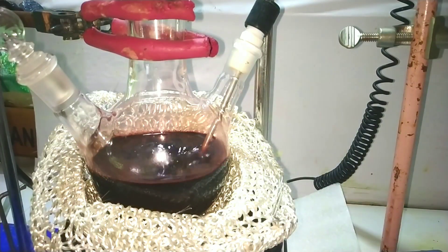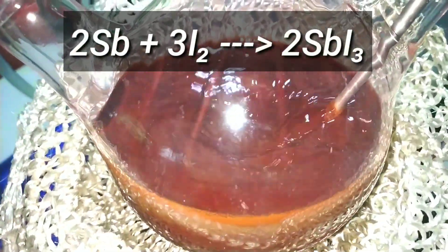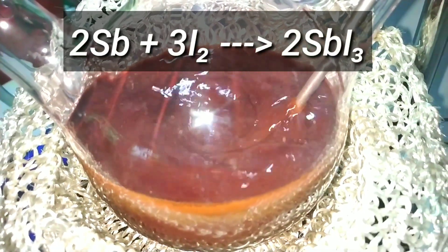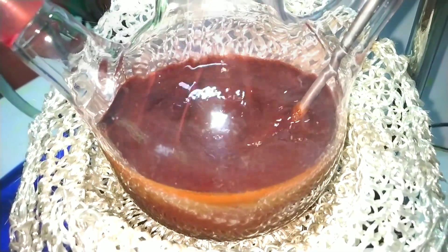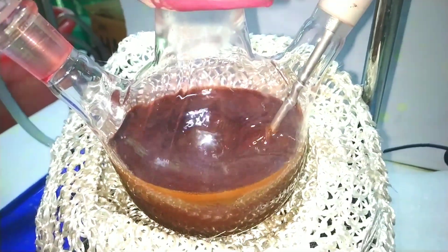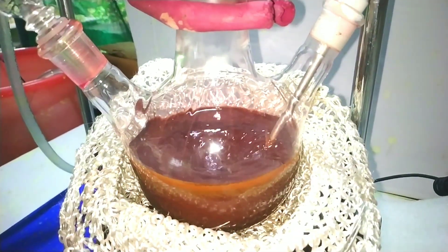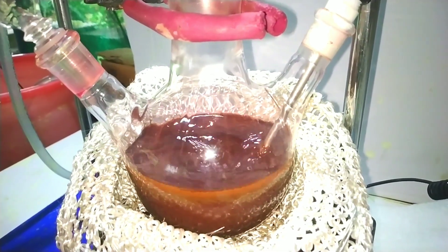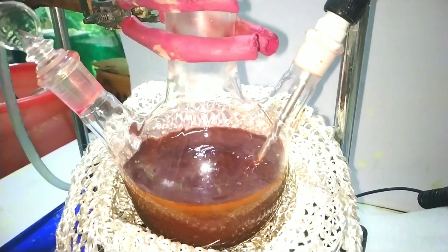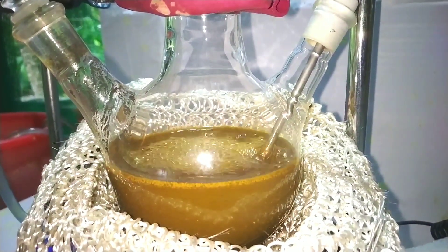Reflux should be continued until the color of iodine disappears. Antimony element directly combines with iodine to form antimony triiodide, where antimony is in the plus 3 oxidation state. You can clearly make out the changes in color: initially it was violet due to the presence of iodine, then the iodine content decreases and the color turns red, and finally you get a dark yellow to green color indicating the end of the reaction.